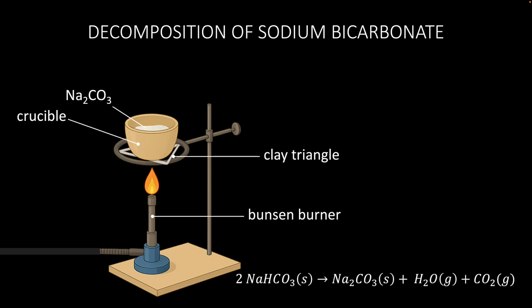And this will certainly be true here, except that the reaction will appear to have lost some mass. This is because the carbon dioxide and water produced will escape the reaction vessel as gases. We will use this loss of mass to determine the percentage of sodium carbonate in the mixture.